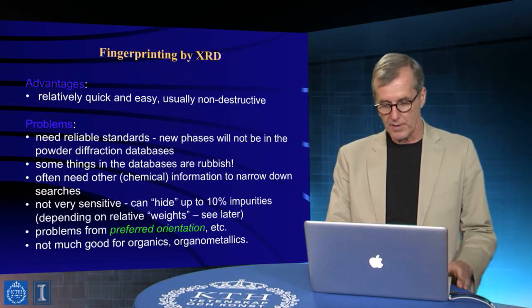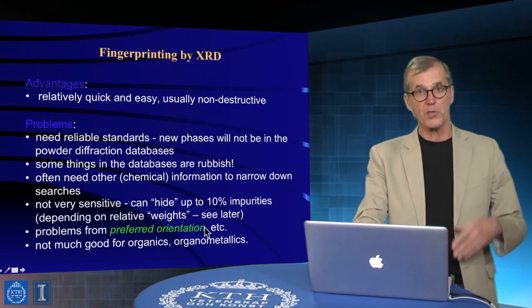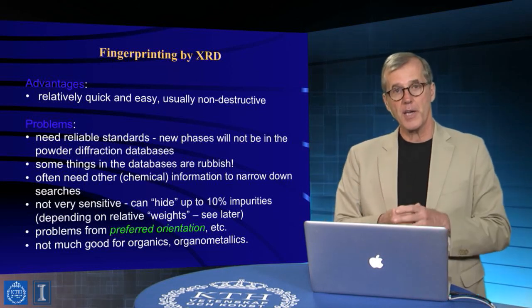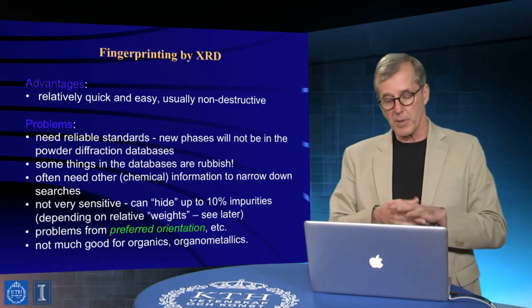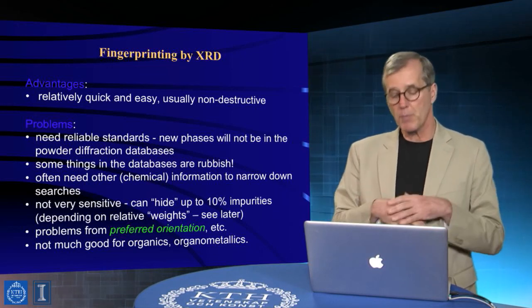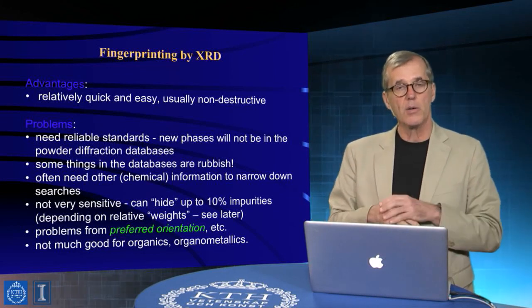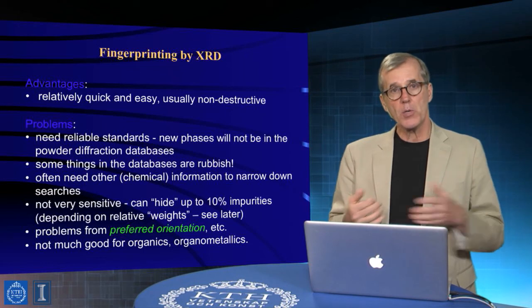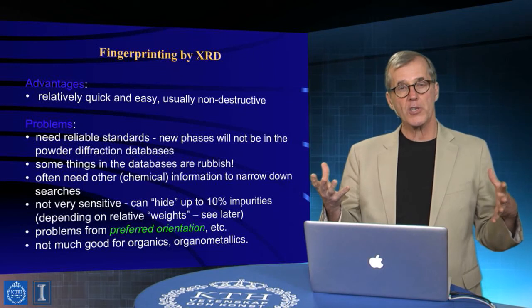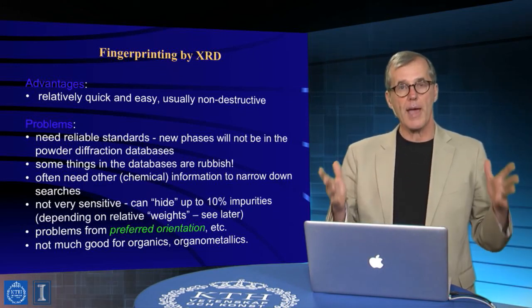But people are forgiving. Another thing you have to worry about is the issue of preferred orientations. We saw the example of the single crystal, the large one. If we had a preferred orientation, some reflections go silent. But even in finely dispersed materials, for example platelet structures, they might lie all flat to first order, and hence we don't see, even in the powder spectrum, something representative of all the things that would be present in diffraction collected from an isotropically averaged set of projections.